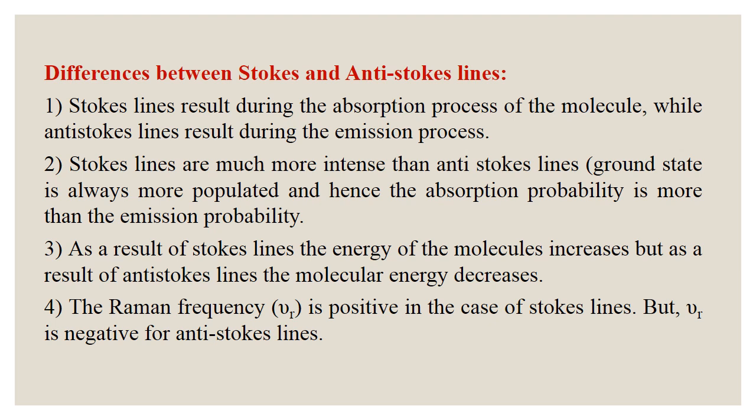Difference between the Stokes lines and anti-Stokes lines. Stokes lines result during the absorption process of the molecule.